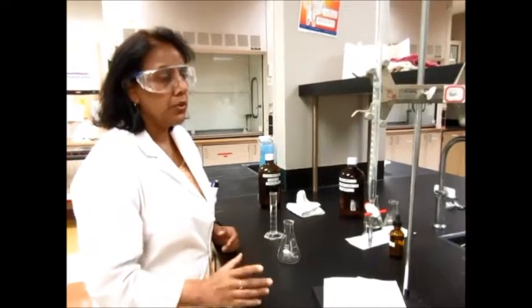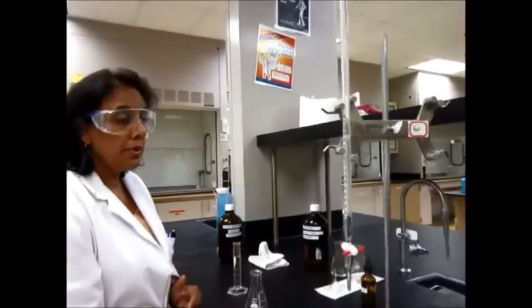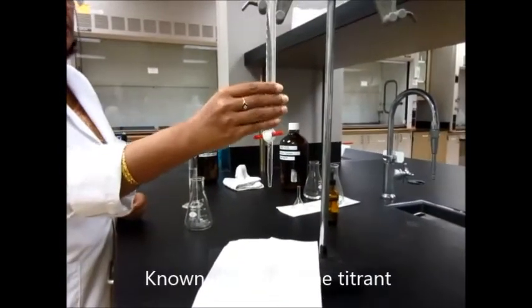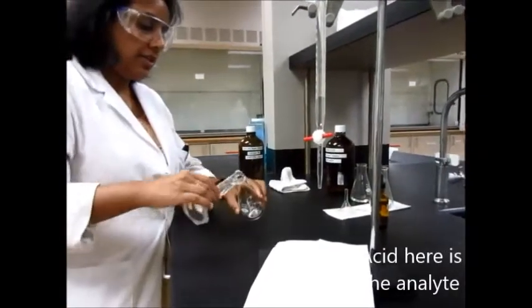To do a titration you will need two solutions — one known, one unknown. Your known may be in the burette or in the flask depending on what you're doing. In this case I'm going to show you an acid-base titration: my base is in the burette and my acid is going to be in an Erlenmeyer flask. I'm taking 25 milliliters of the acid.